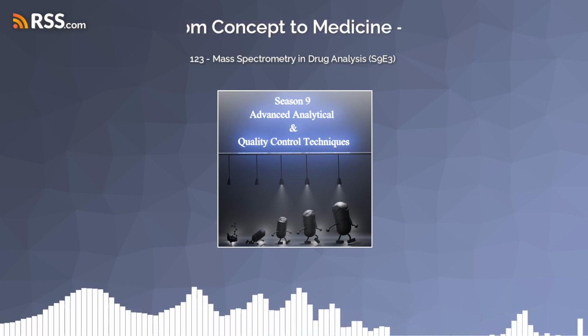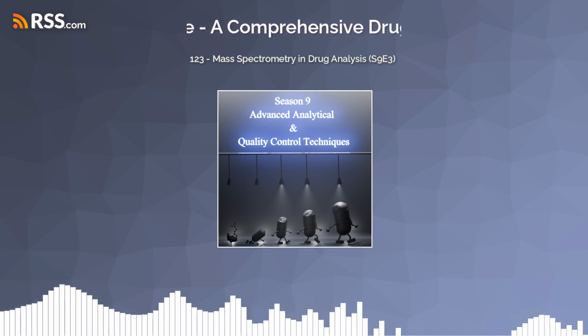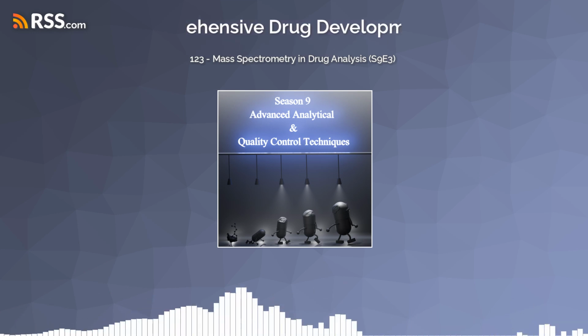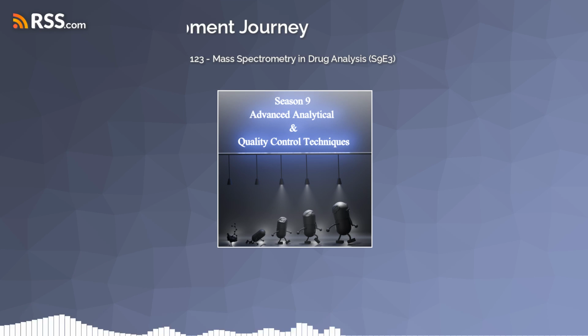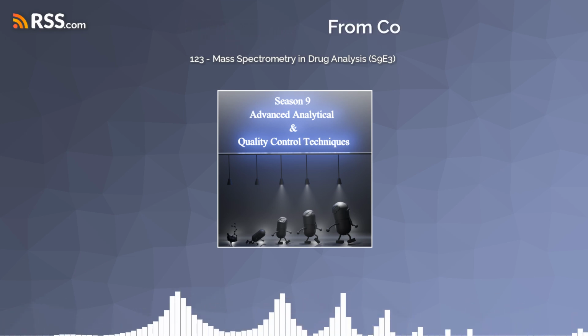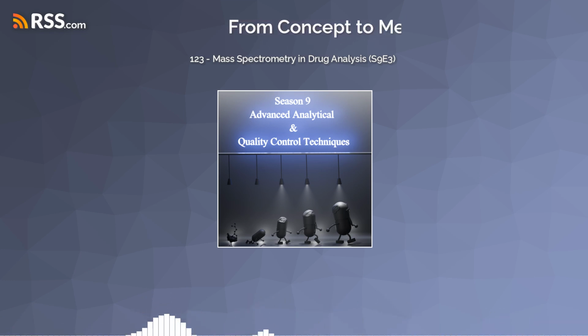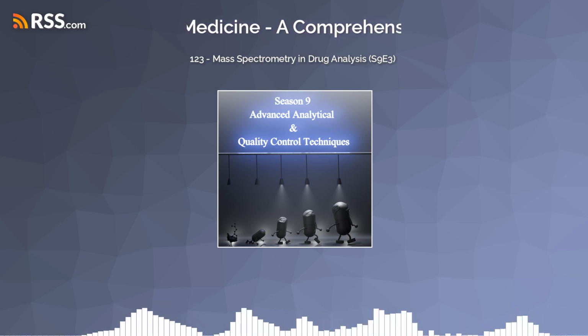Now, our sources for this deep dive don't give specific examples of mass spectrometry swooping in and saving the day, but could you give us a sense of how it might play a crucial role in solving real-world problems in drug development? Okay, picture this. A pharmaceutical company is doing stability testing on a new drug. They're checking to see how it holds up over time, and they use a technique like LCMS to track it.